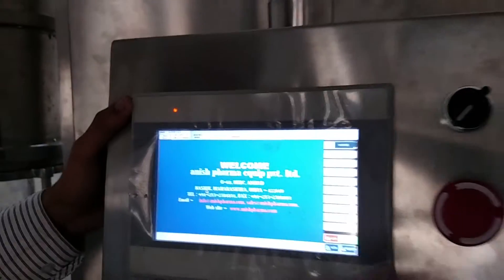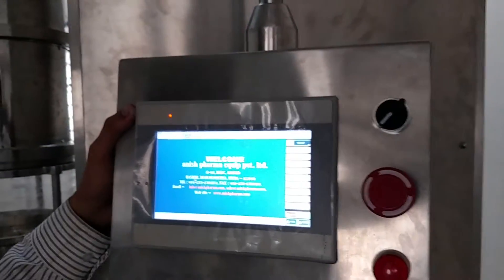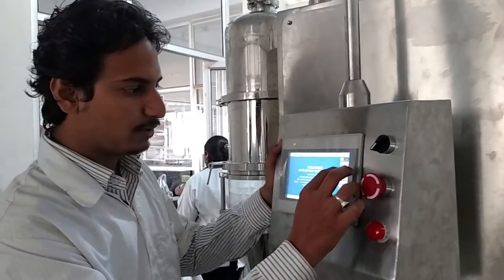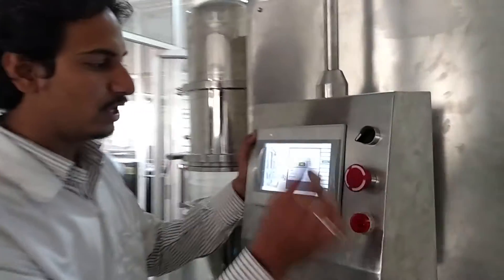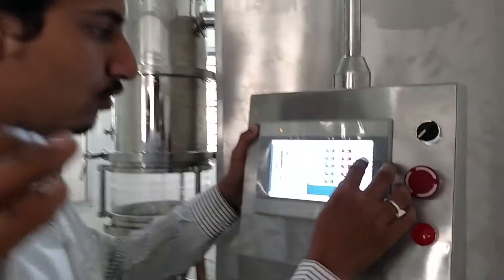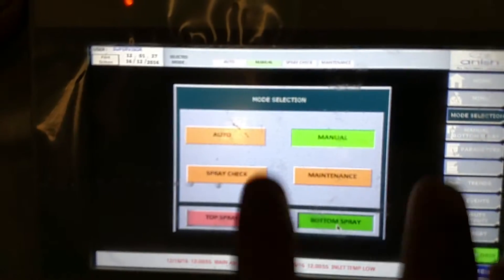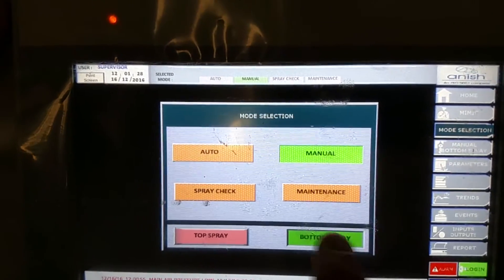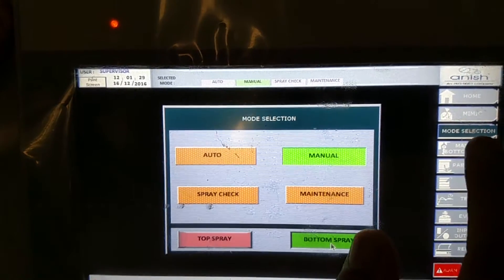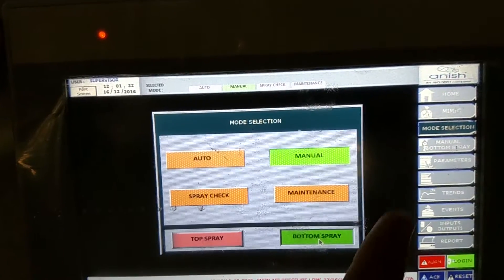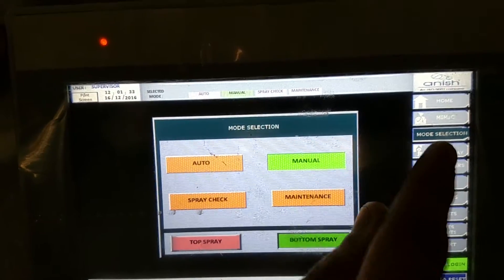Now we have to select the mode we have to use. We will now prepare manual bottom spray. In mode selection, there is manual bottom spray. Manual and bottom spray are now selected. Then you will see the option here, like manual bottom spray.